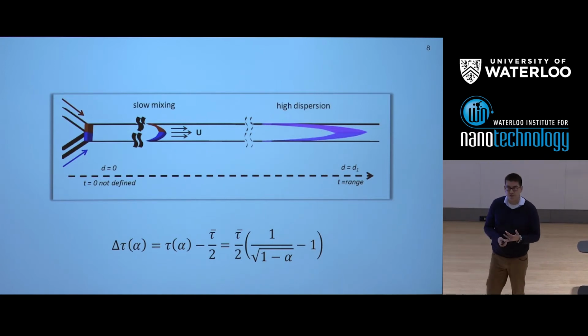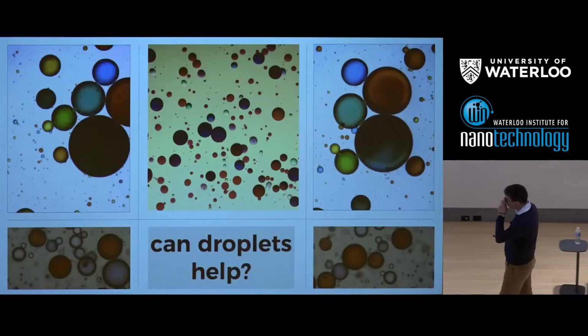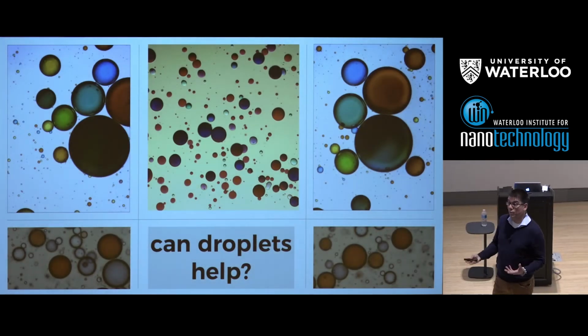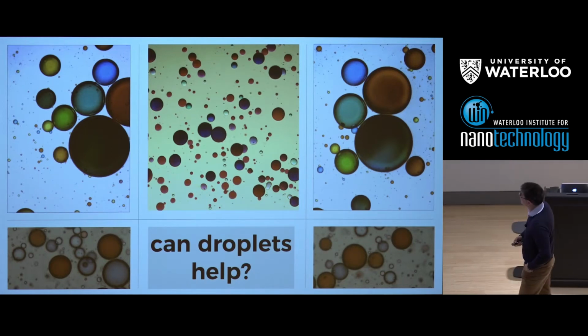So unfortunately, we thought about trying to deal with this in many different ways, all of which were wrong. Initially, we started to think about how we can modify the surfaces. Can we make them super hydrophobic? That helped to some extent. Could we make them smaller? That again helps to some extent. But ultimately, it was far too long before we realized that what we needed to do was to move away from continuous flows and start thinking about using segmented flow. So this is really going to be the bulk of the rest of my talk, and I see time is already moving on quite quickly.